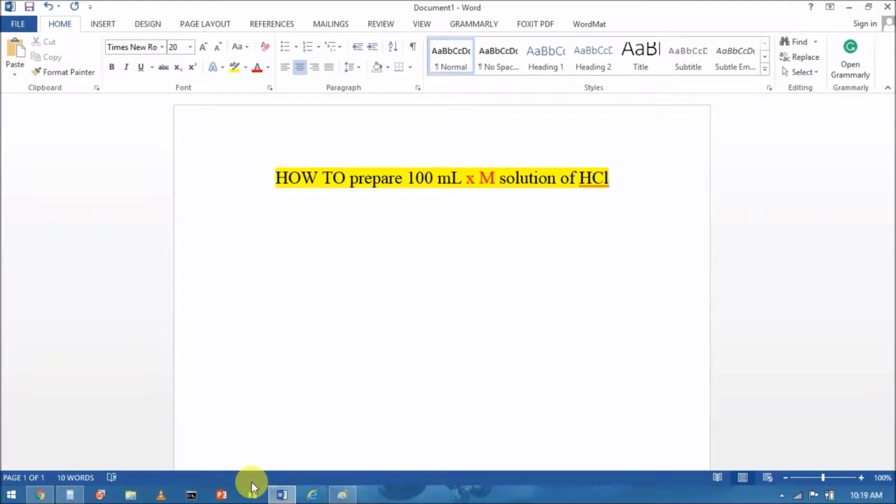Hello friends, today in this tutorial I will show how to prepare 100 ml of X molar HCl solution.